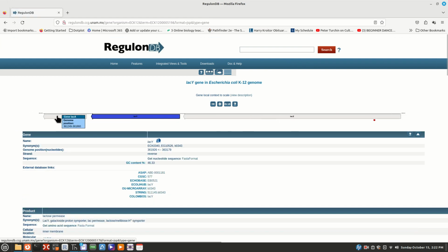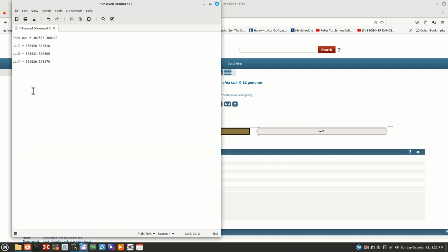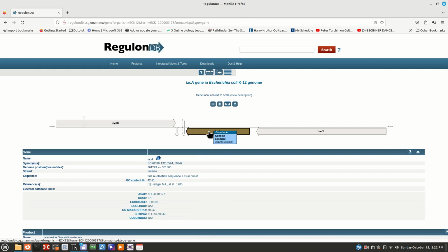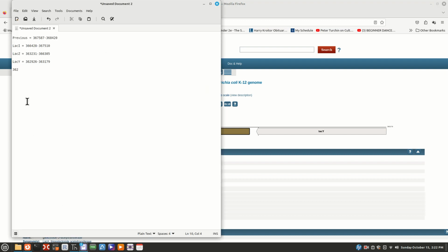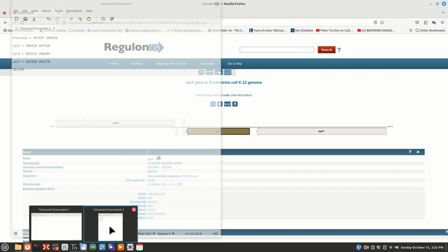To lac A. And lac A is 361249. 361249. I'll go ahead and write that. 361. Oh, I've already forgotten it. Let's see. 361249. 361249. All right. To 361860. All right.